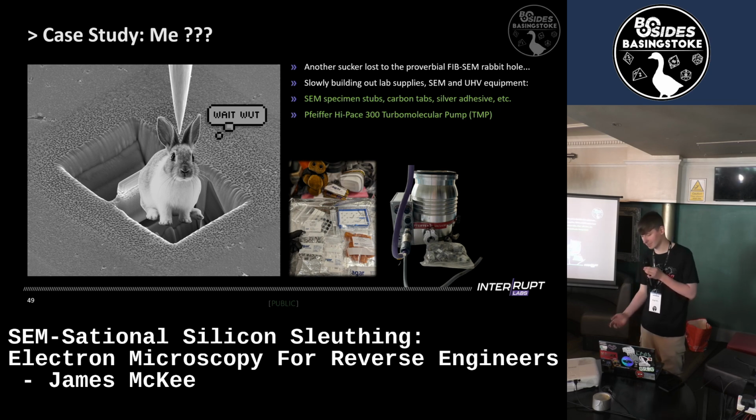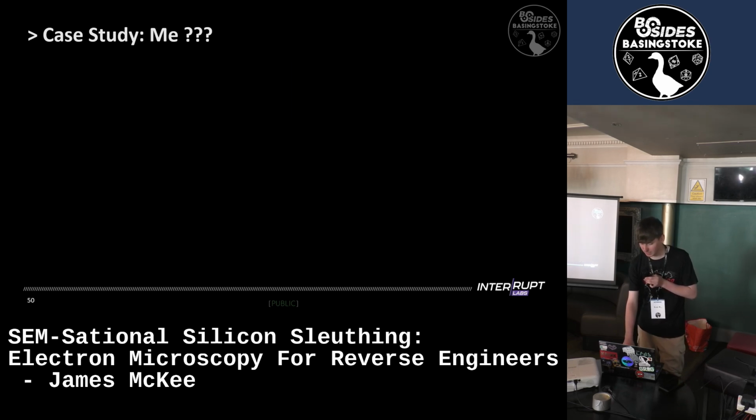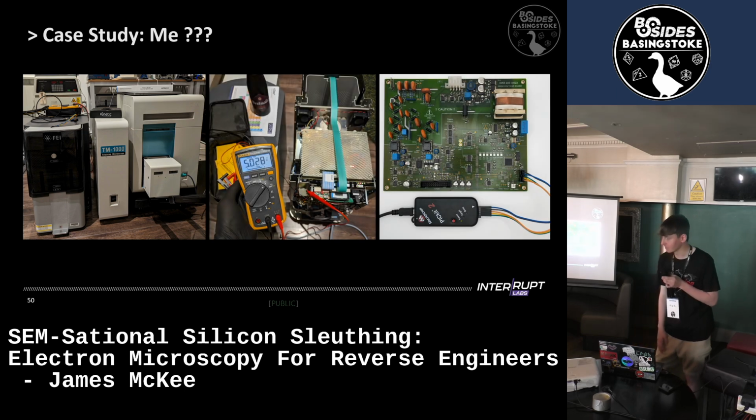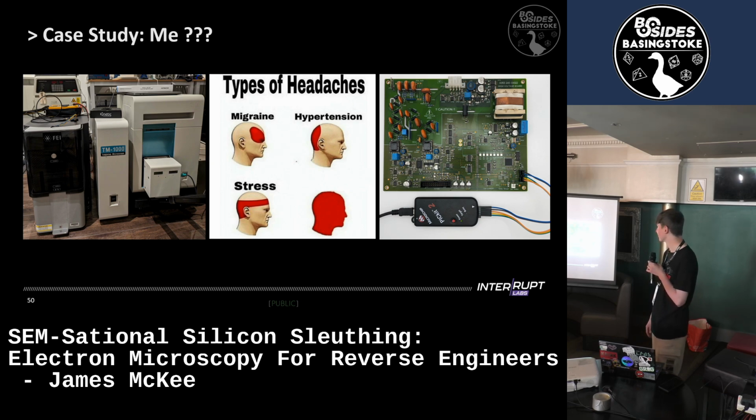It's a massive amount of work, it's good fun. So I've got a bunch of stuff in the apartment. I think I'm up to 2 SEMs now. These are little desktop ones, so they're a lot more usable. However, they did require a lot of repairs, so not great unless you can spec them out like a £160,000 machine. And that's kind of the same headache.